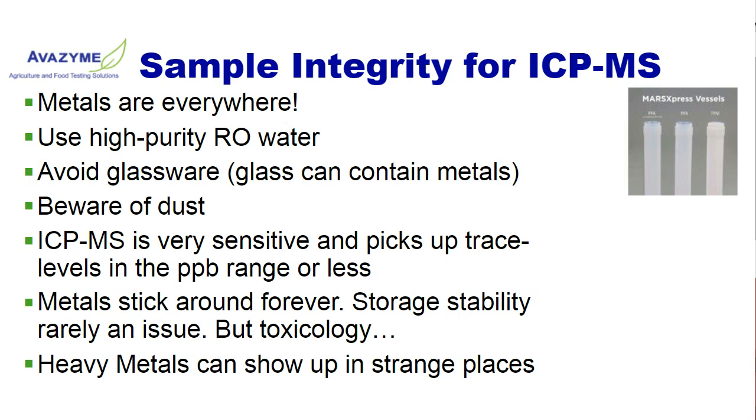As we work with the samples, we're very careful not to introduce any outside sources of metals. We're careful with transferring, and other extraneous sources are minimized as best we can, because metals stick around forever. They do not degrade, and so storage stability is not a problem when it comes to a storage study.